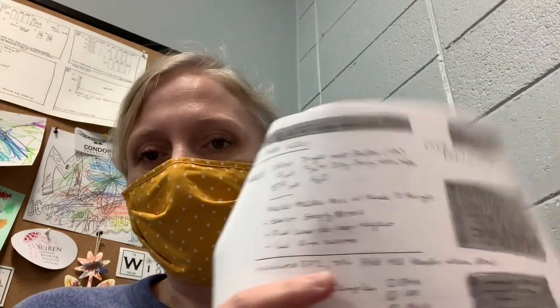And then people start to get a little bit lazy and take too many shortcuts and just jot things down. Leave out things. Where are these samples? Where did they come from? Where did you get them? How long did things last? What reagents did you use? All of that might be missing in someone who's just writing things down.